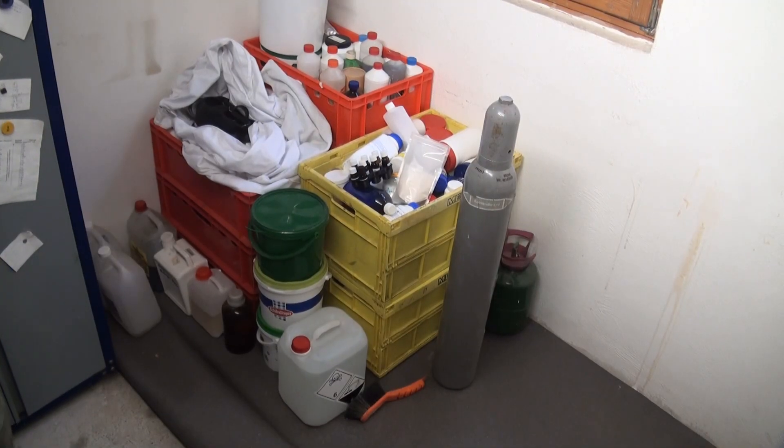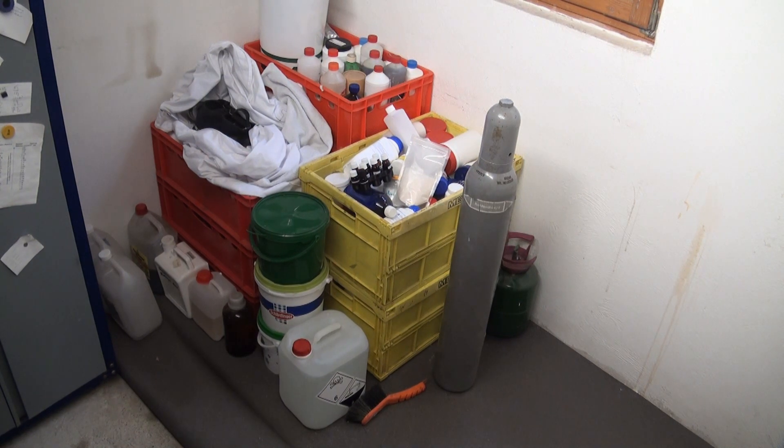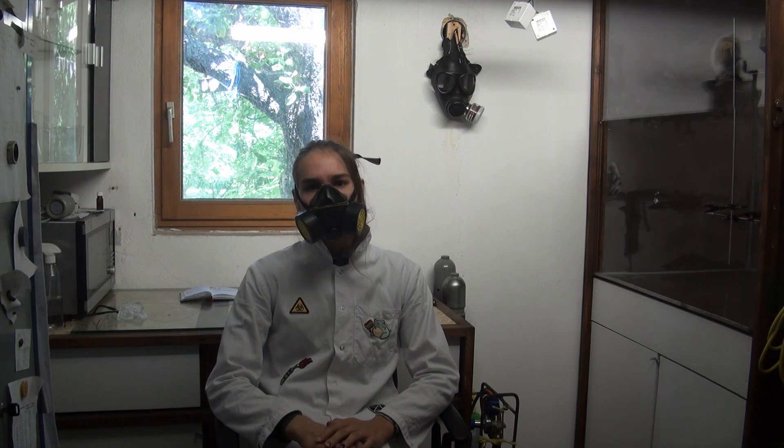And now here you can see nearly my entire laboratory in boxes. After the old furniture was removed, it was of course time to build new ones.